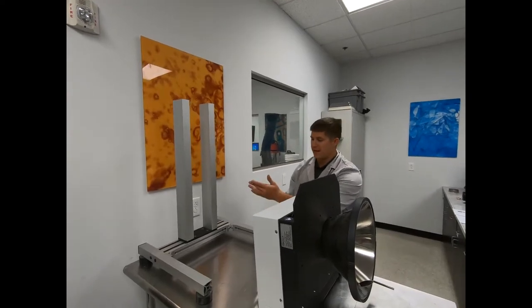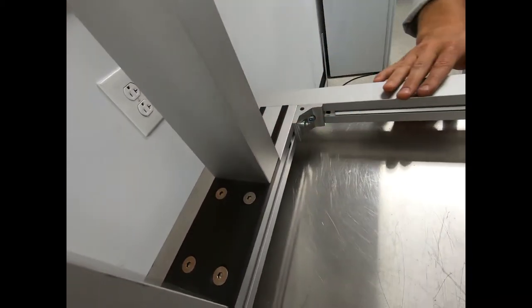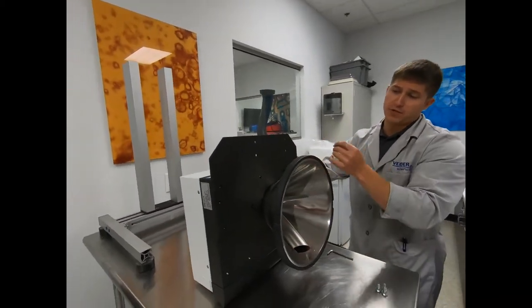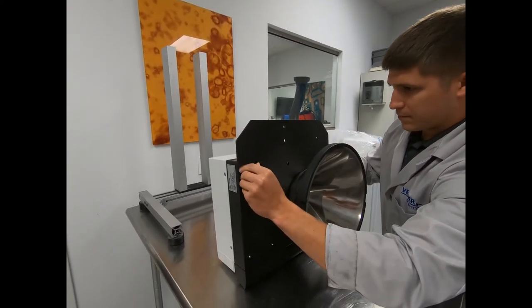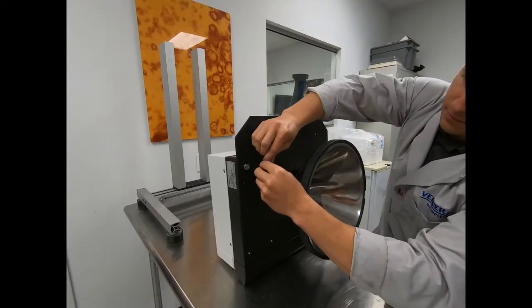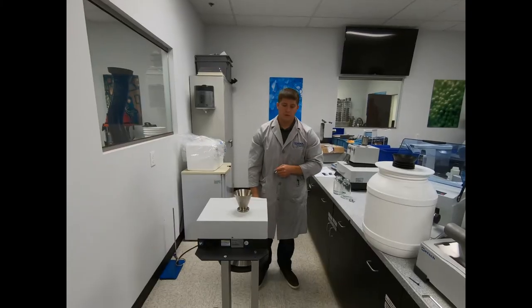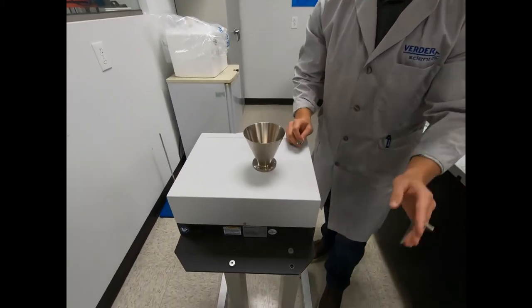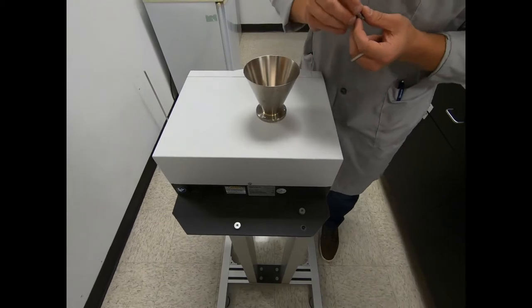Once you have your base frame and stand fully configured, what you're going to want to do next is install the metal bracket to the back of the housing by inserting four screws into their corresponding holes. Once the mounting bracket is on the back of the housing, line it up with the four corresponding holes on the back of the stand.